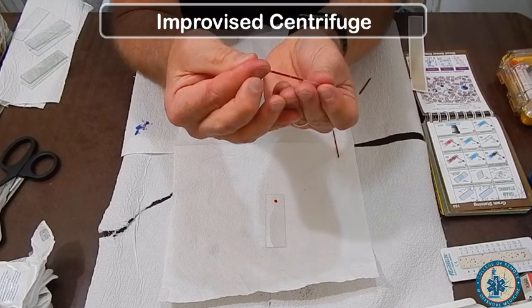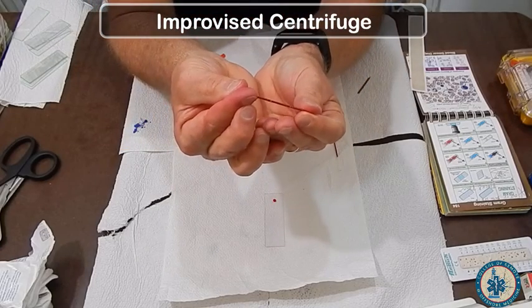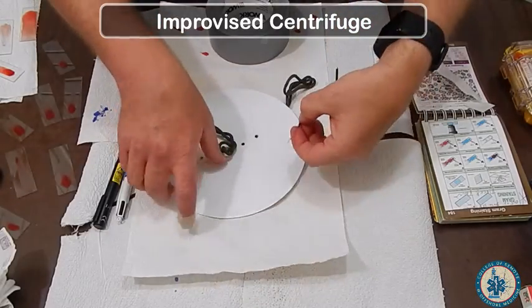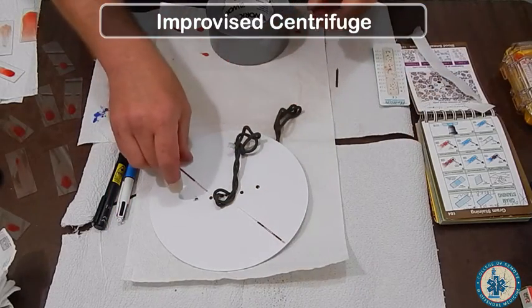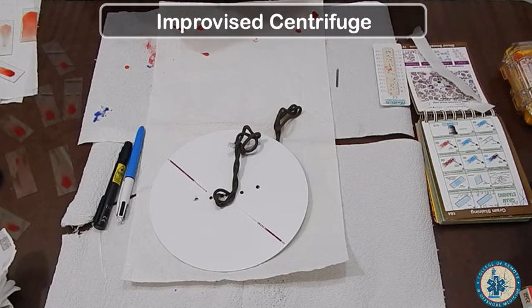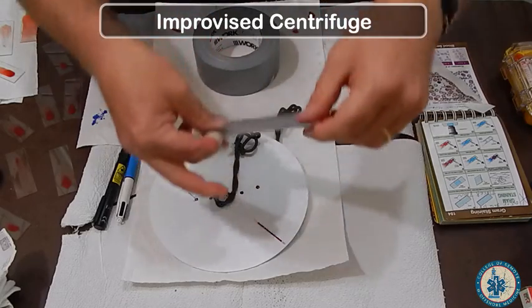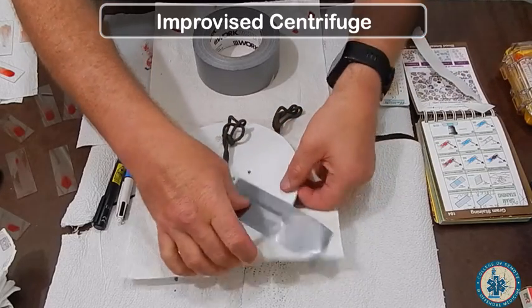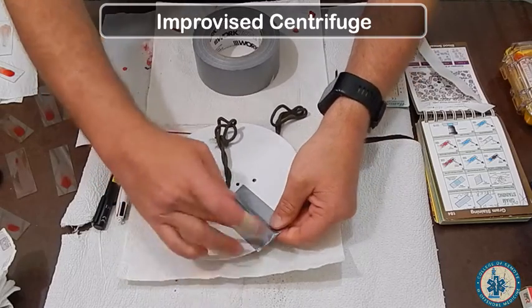Same technique: get your blood, milk it out of your finger, and have the capillary tube below the level of the blood. You will make a round centrifuge — a paperfuge. You want it balanced, so always have an equal number of capillary tubes on each side. I like to do one on each side so you don't get too much weight. Use duct tape or gaffer tape and tape the capillary tube down, making sure the tape goes around the edge of your paperfuge.